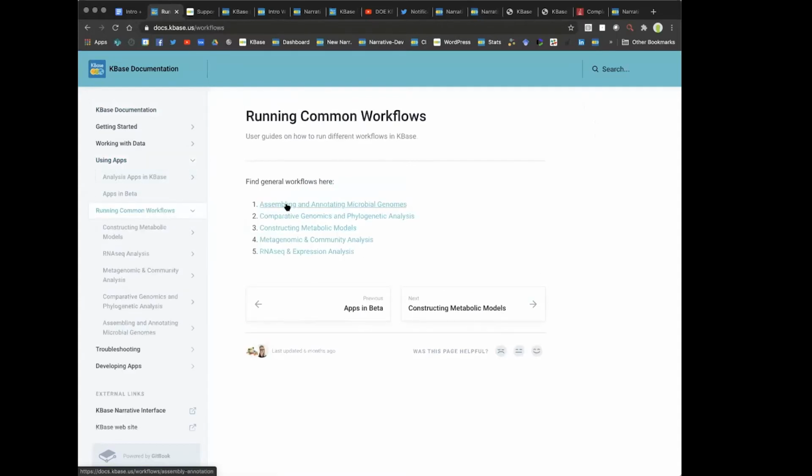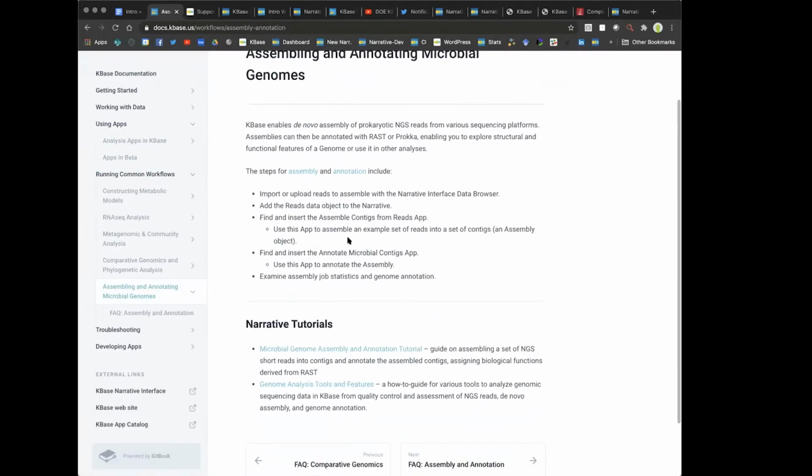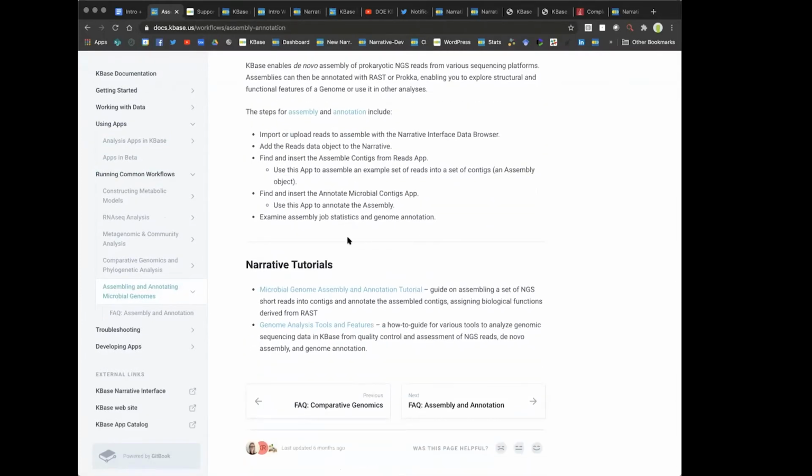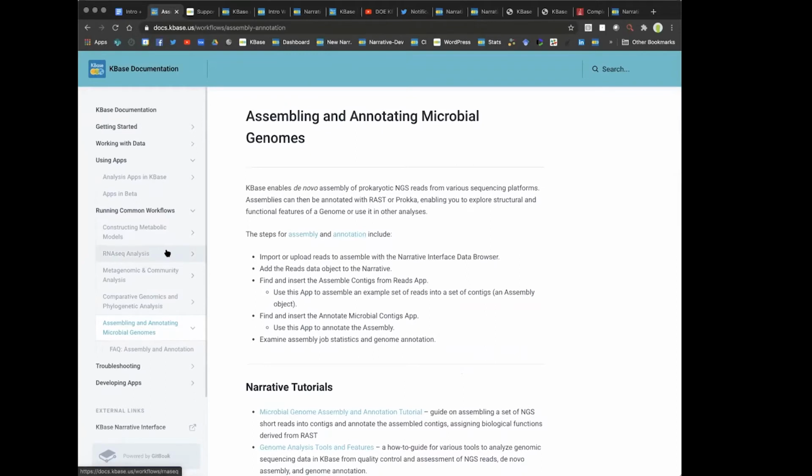Someone was asking about de novo assembly in the chat. You can see lots of different resources on the documentation website. So Ellen Dow and Zach Crockett and myself and others have tried to capture as much as we can here. So even the questions that you all are asking in the Q&A doc today, we'll try to add some of this to the FAQs on this documentation site. So just two more resources to help you learn how to use the system.